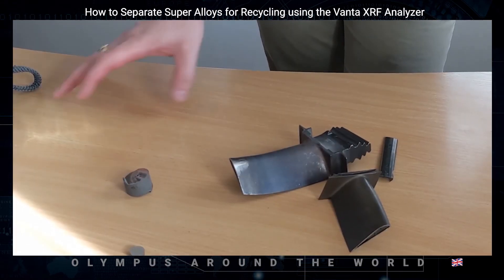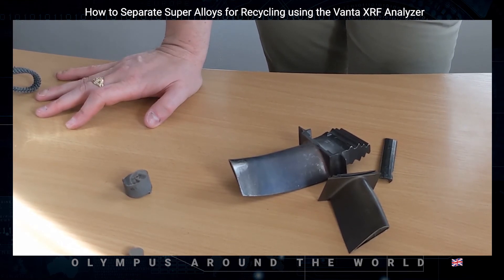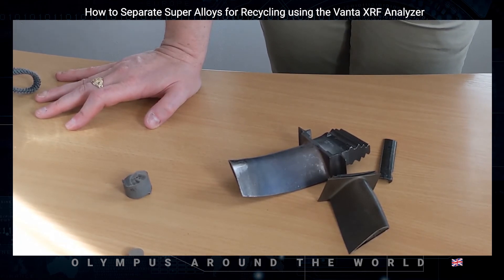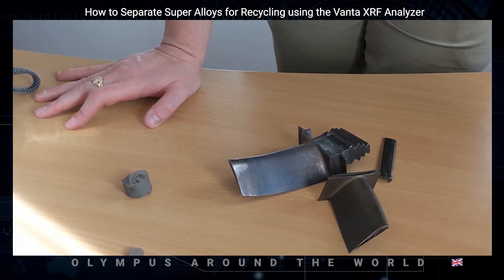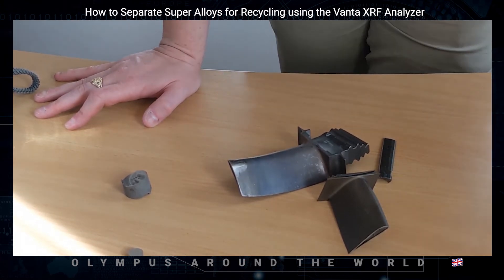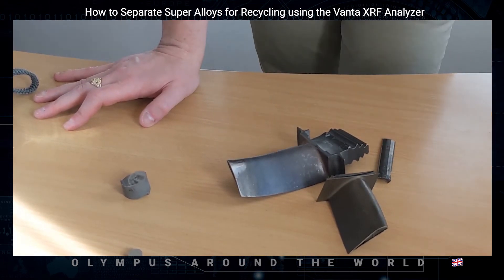Sample preparation is critical to ensure the best analysis possible. By grinding or cleaning the surface, you will vastly improve the analytical performance on elements with lower concentrations — especially the commonly exotic elements that have the overlaps determining the alloy grade. These include elements such as tungsten, tantalum, rhenium, and zirconium.